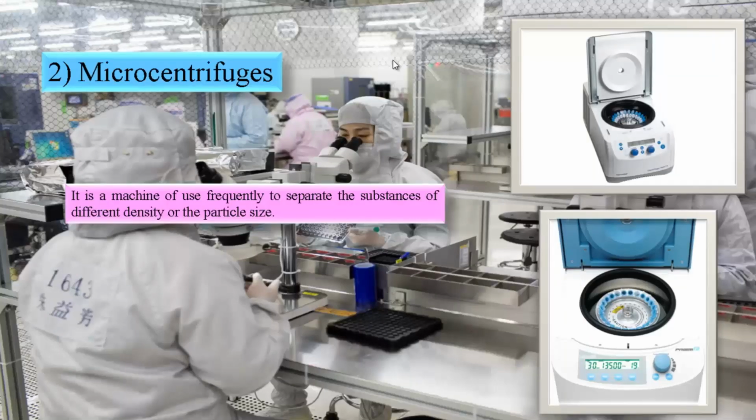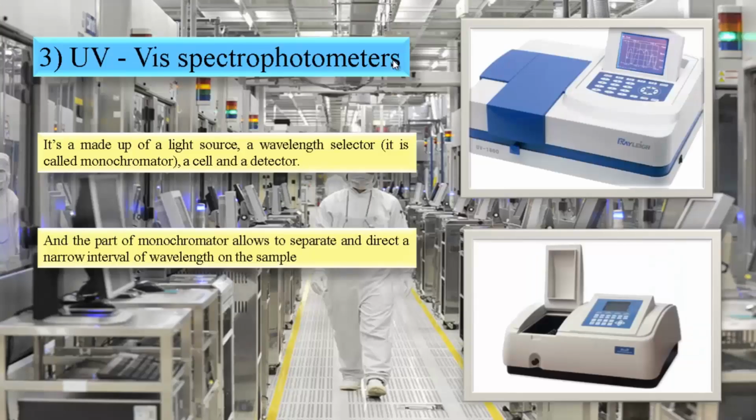Second, we have microcentrifuges. It is a machine used frequently to separate substances of different density or particle size. Third, we have UV-Vis spectrophotometers. It is made of a light source, a wavelength selector called a monochromator, a cell and a detector. And the monochromator allows us to separate and direct a narrow interval of wavelength on the sample.